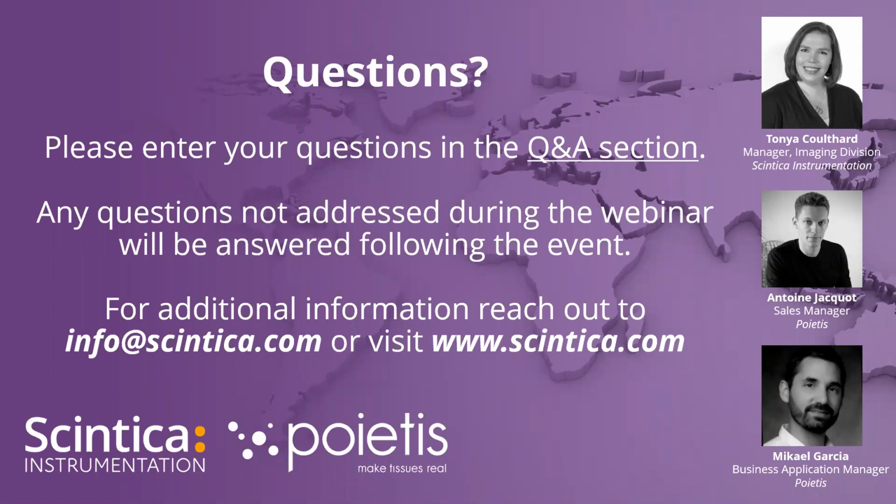Can you elaborate about the effects of laser-assisted bioprinting on the stress and cell viability? So this is something that we talked about during the first webinar quite a bit, in terms of the benefits of using the laser-assisted bioprinting system on the NGbr: the forces that are typically required to extrude the bioinks from extrusion and bioinjection heads aren't necessary with laser-assisted bioprinting. So with the cells spread over that metallized substrate, a laser light simply hits the metallized substrate, the droplet forms, and it shoots up towards the plate that you're printing on.